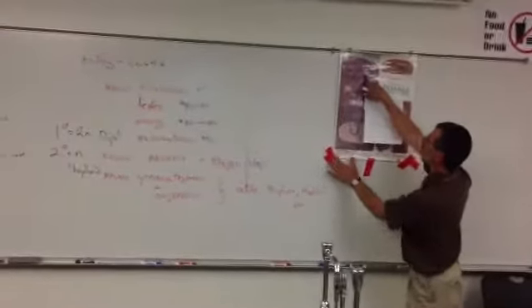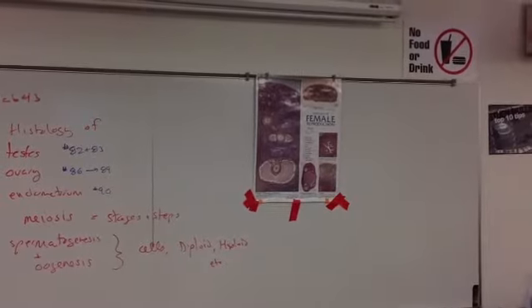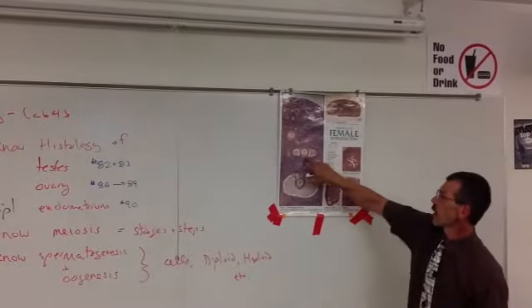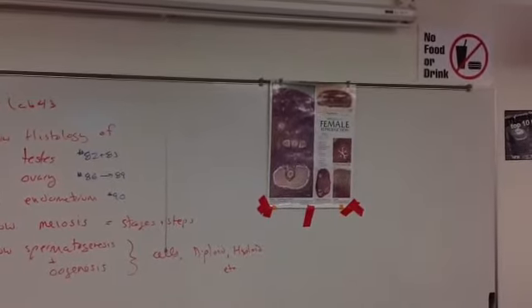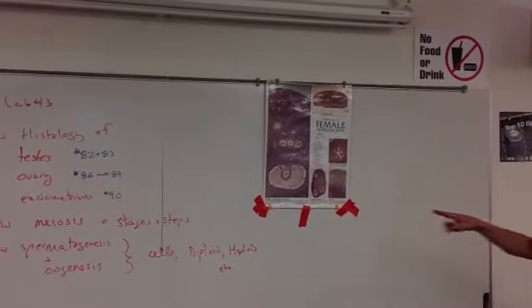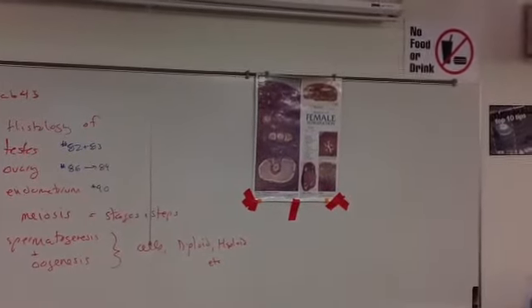All right, so let's do our primary follicles. Our primary follicles look bigger. What kind of oocyte lives in a primary follicle? A primary oocyte, because it has not finished meiosis yet. Let's go to a secondary follicle, called the Eye of Sauron, right here. So, what kind of oocyte is in the secondary follicle? Primary. A primary oocyte, because you haven't finished meiosis yet. Then you've got the mature follicle, which is the one that's got the big space in it, also called Graafian or vesicular. What kind of oocyte is in that one? Secondary, because I'm finishing meiosis.